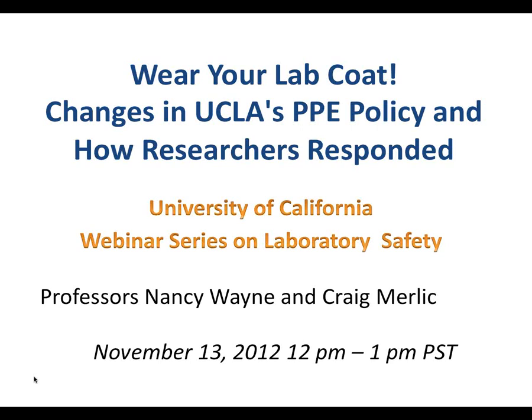Like safety glasses, everyone has worn safety glasses for a long time in chemistry, and it's the norm. And so it just takes a little bit of time to set the expectations regarding other types of PPE, and then the researchers comply.